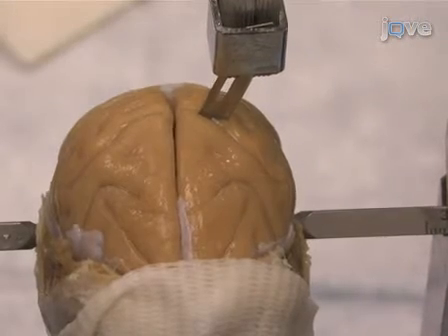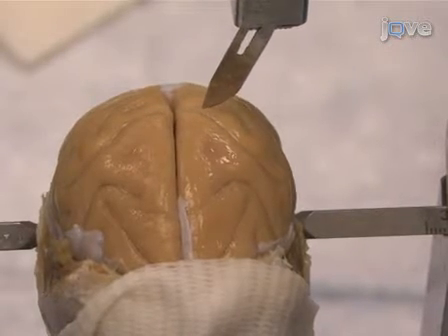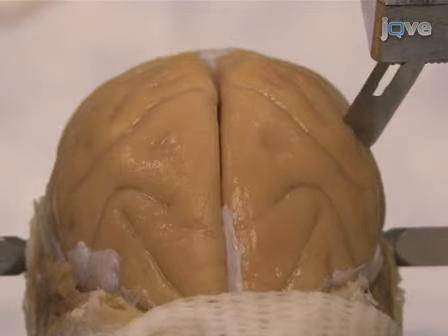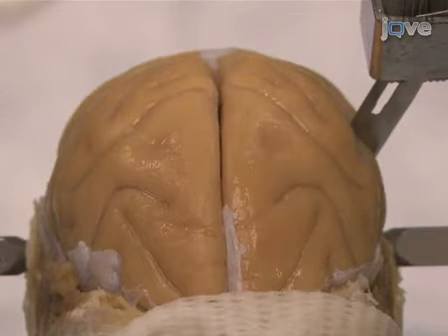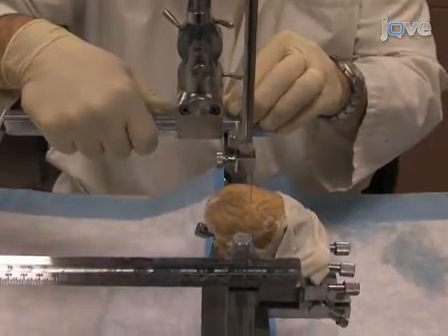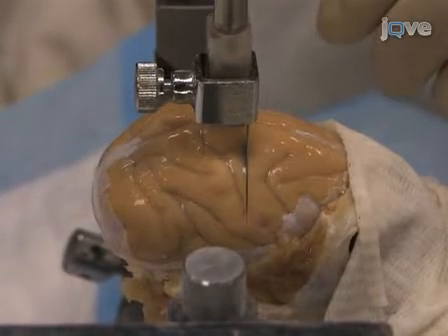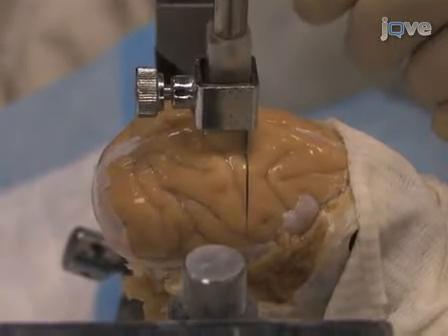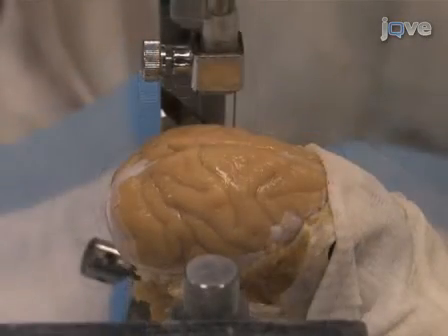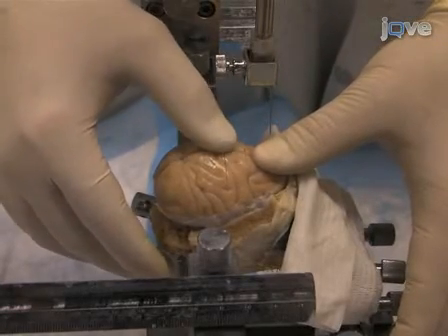Raise the blade to completely clear the brain surface, then move medially to just overlap your first cut and lower the blade again. Continue to make overlapping cuts until you reach the opposite edge of the brain. This completes the first coronal block. Move the manipulator one centimeter forward or back along the AP axis and make another series of cuts in the coronal plane, parallel to your previous ones. Continue this way until you have blocked the entire brain.